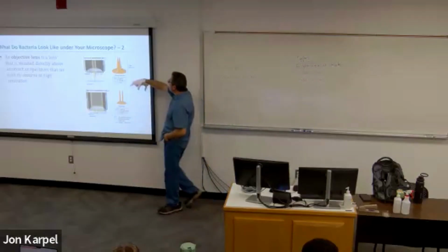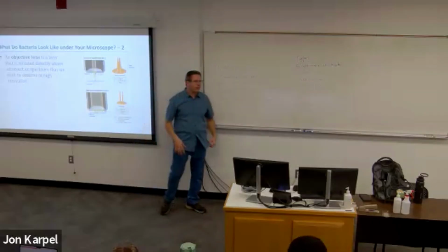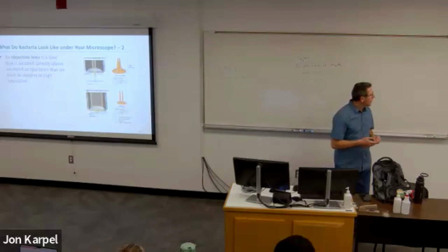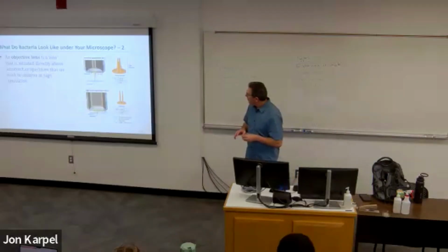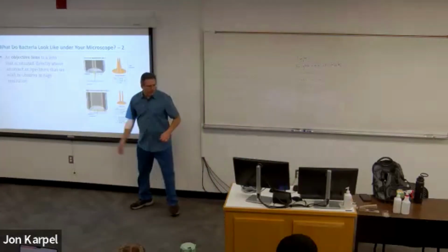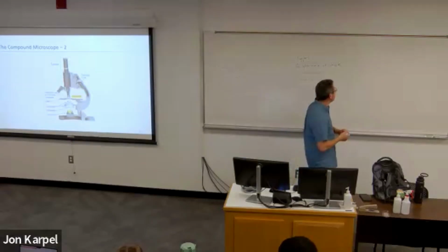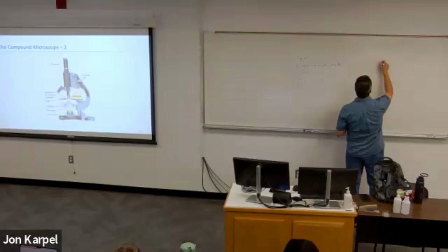We'll see that with the lower power magnifications, the resolution is not as good as with the higher powers. That's why we always want to try to get up to the highest power we can, depending on what we're trying to do. But usually that is going to allow us to see things a lot better. And those are the different objectives. Actually, where's that picture? I'll skip ahead here. There's a picture of a microscope here. So the different things we have, you have the eyepieces.